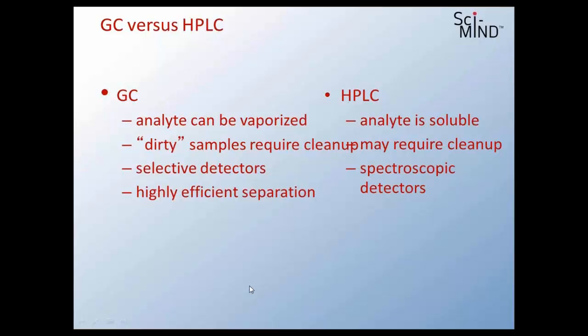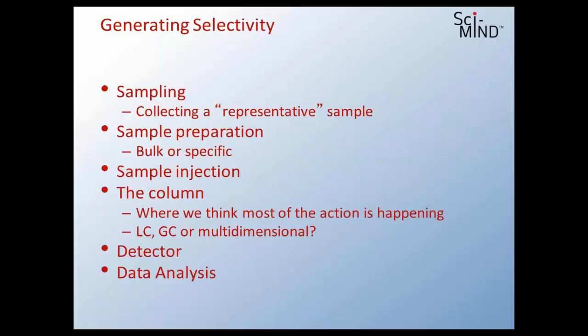Probably what we get in GC more routinely and easily and less expensively is a high resolution separation. That's another one of those things that we think about. We can get a lot of efficiency out of a very simple GC system, and in some ways a simpler GC system than the similar HPLC system. So there are a few questions that help us with that challenge. I think the HPLC folks among our subject matter experts would certainly argue that you can do anything by HPLC. My colleague here at Seton Hall, Yuri Kazakevich, who's a great HPLC theoretician, would certainly argue with me on that. The question is, can you really do it practically? A lot of small molecules are just better done practically by GC. Those are some things to think about.